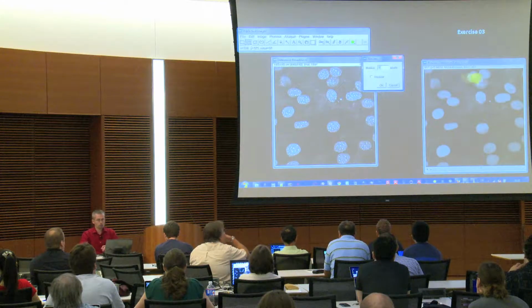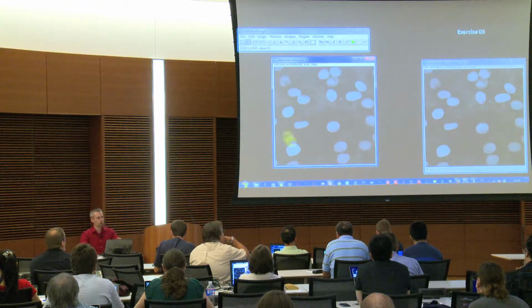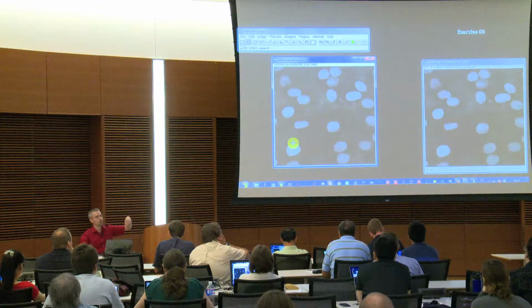And this was done with a radius of 5, which gave us a fairly good outcome. And then we should see the same here and apply that. So we continue working with this individual image. If you still have the stack, then please duplicate that image out.